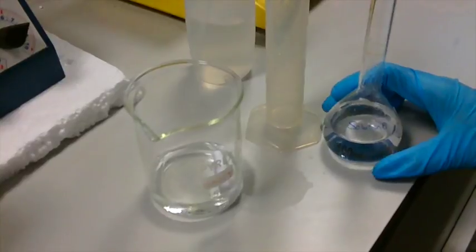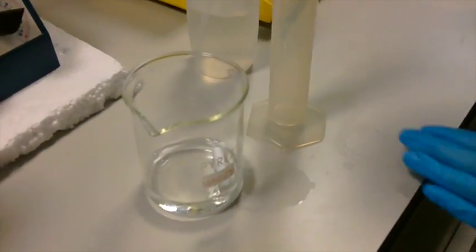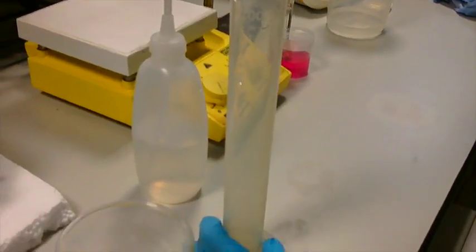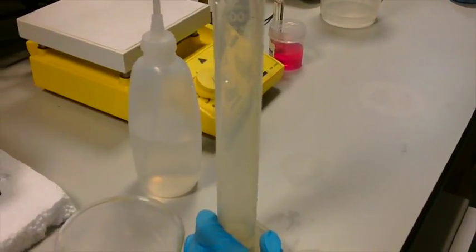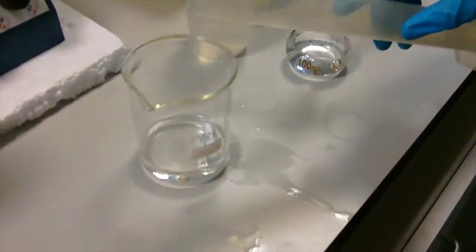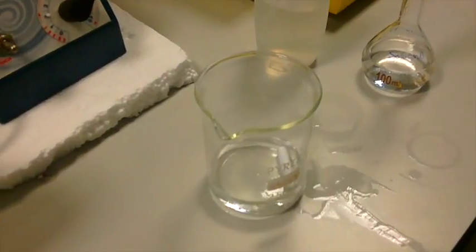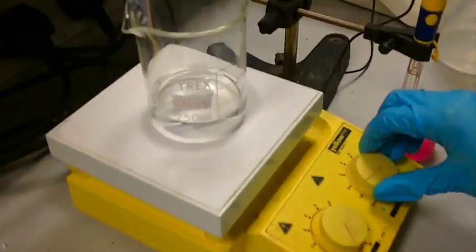You will then need to add the correct amount of solution B. In this case 6.15 ml for pH 6. This is now poured into the same beaker with the magnetic stirrer, and you move it over then to the magnetic stirrer and turn the stirrer on.